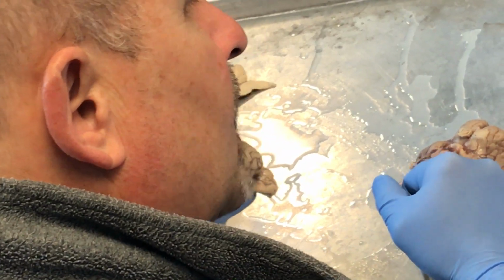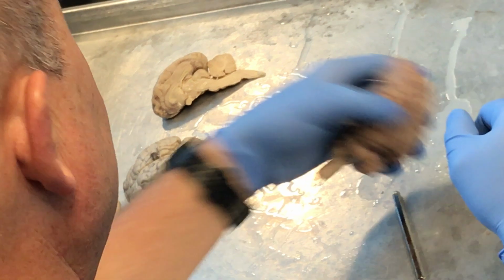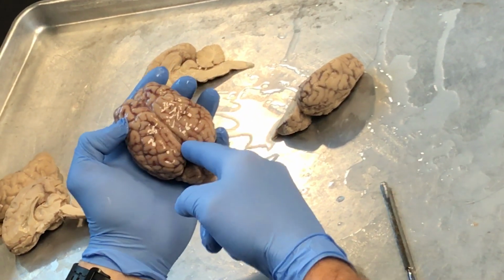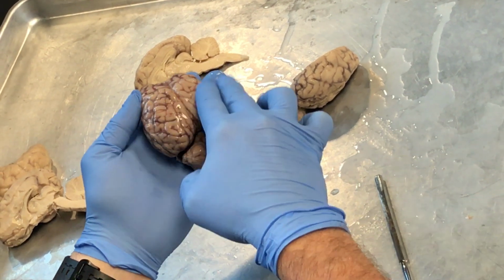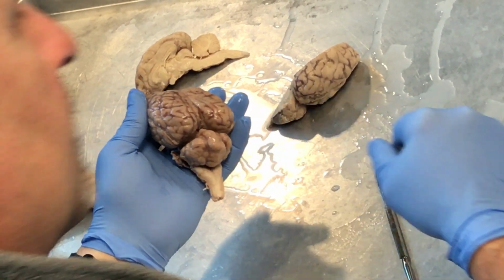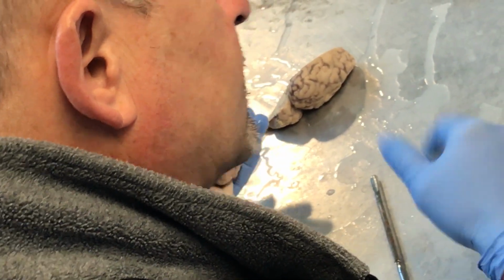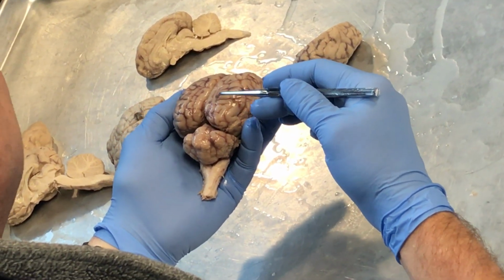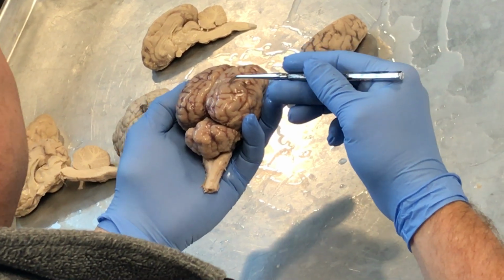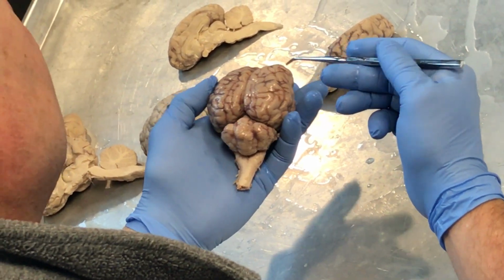All right, next thing is longitudinal fissure. If you look right here, the longitudinal fissure goes between the 2 left and right halves of the cerebrum. This is cerebrum here, cerebellum back here. Then the next thing are the convolutions. These are the convolutions, all these hills and valleys that you see. Collectively, they're called the convolutions.